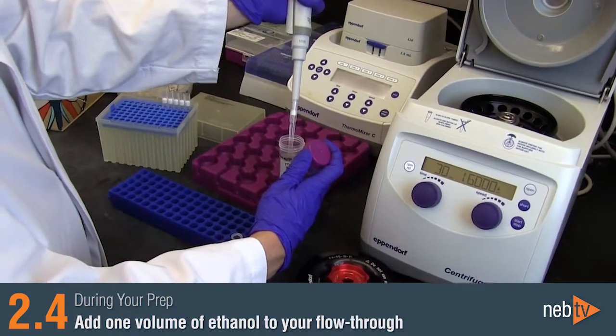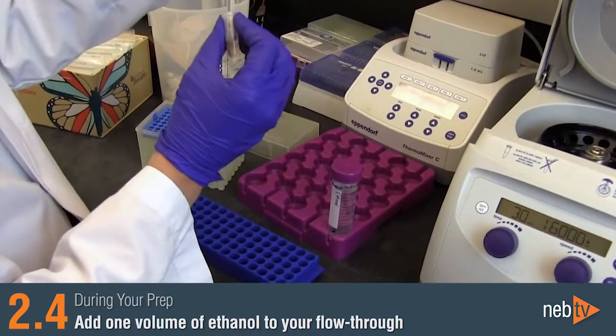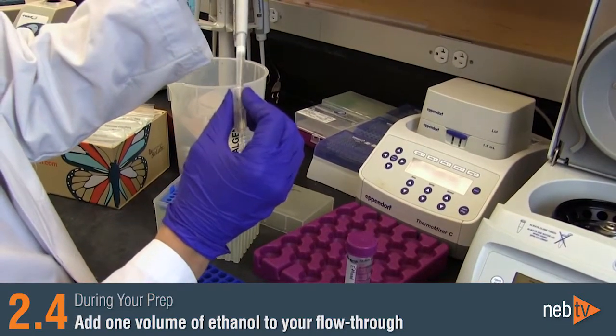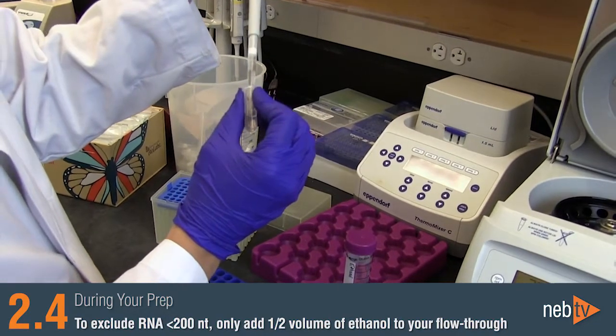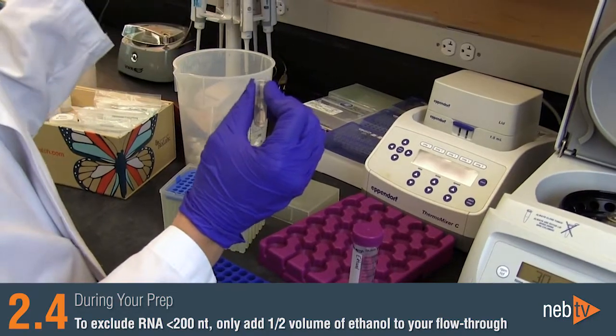If you want to capture total RNA, including small RNAs, add one volume of ethanol to your flow-through from the gDNA removal column in preparation for binding it to the RNA purification column. If you want to exclude RNAs smaller than 200 nucleotides, only add half the volume of ethanol to your flow-through from the gDNA removal column.